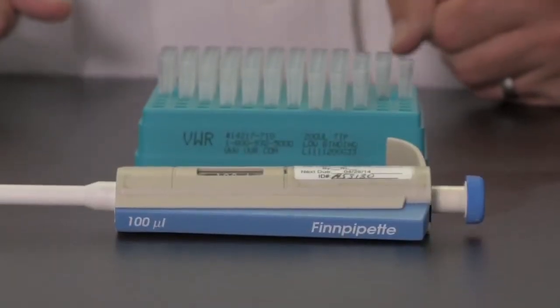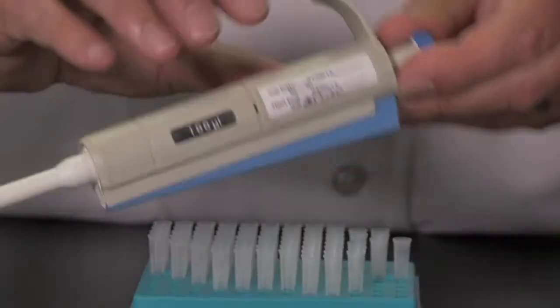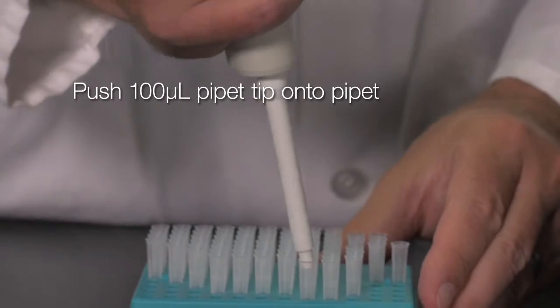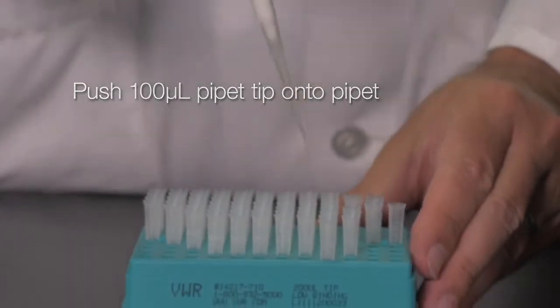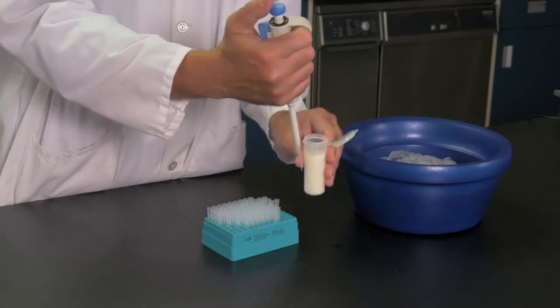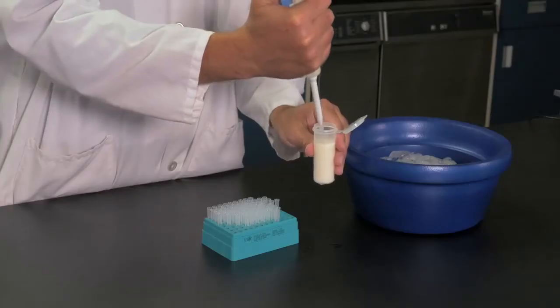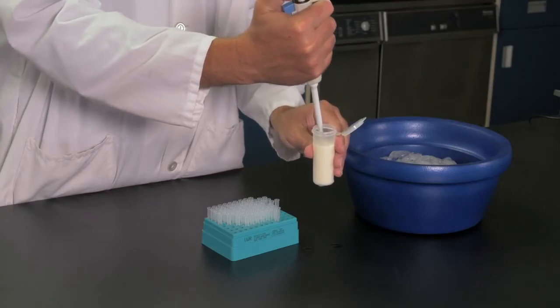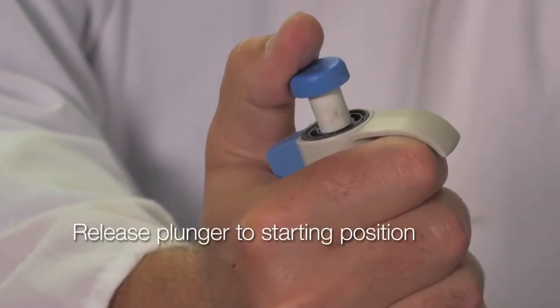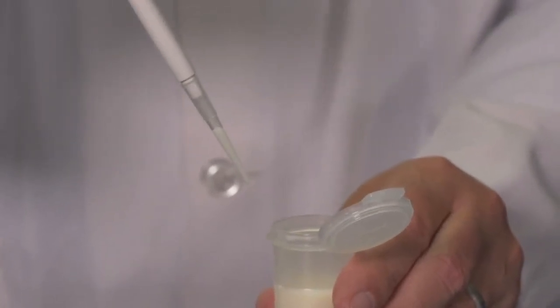These instructions will demonstrate proper use of a 100 microliter fixed volume two-stop pipette. Push the appropriate 100 microliter pipette tip onto your pipette. Press the plunger down to the first stop as shown. Insert the pipette tip into the milk sample and slowly release the plunger to the original starting position. Check to make sure there are no air bubbles in the pipette tip.